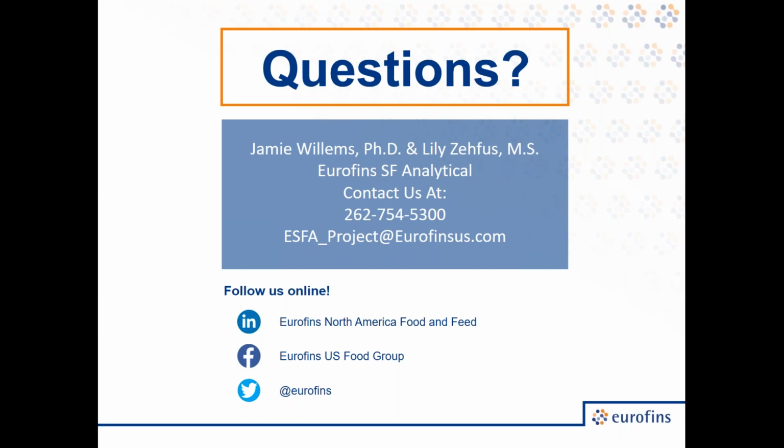And then we would look at the dominant colony forming units, or CFUs. And then these can be compared further by looking at metagenomics sequencing and comparing that to a database to identify the actual specific microorganisms that are present. And in this case, very similar to our other analyses, it is important to have a control because we would have to look for, once again, differences in the microbes that are present in order to actually identify if there's one that should not be there.